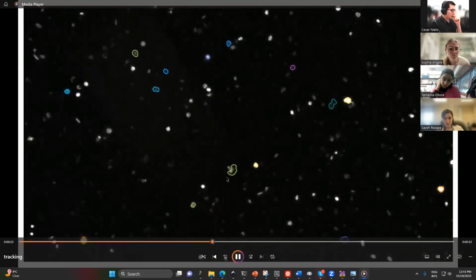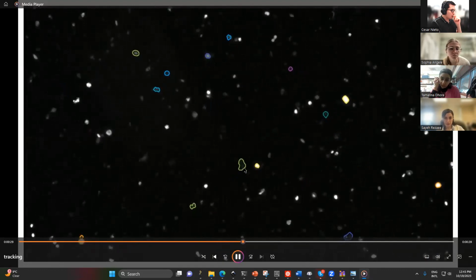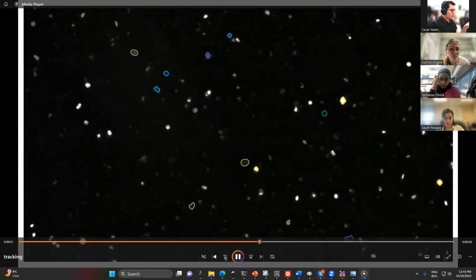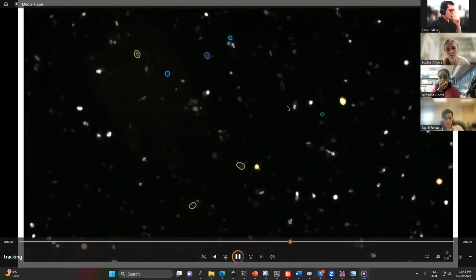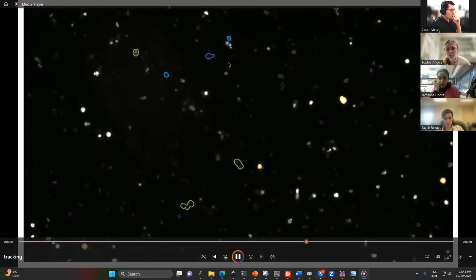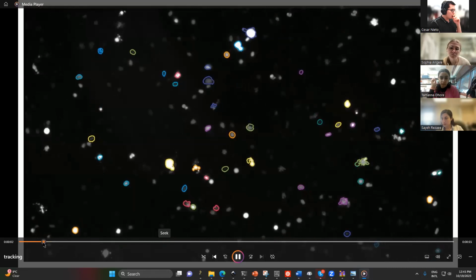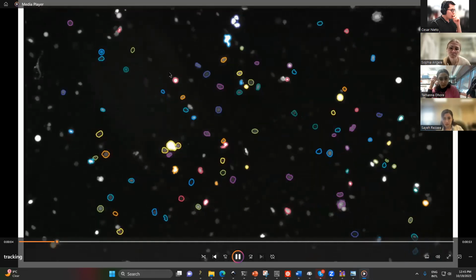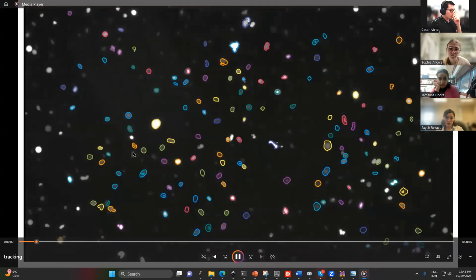Let's say this is always 63, the color in the function color HTML is going to be the same. So here you can check the results of your tracking better, and track every particular cell better if you want to verify by eye what is happening to the cells.